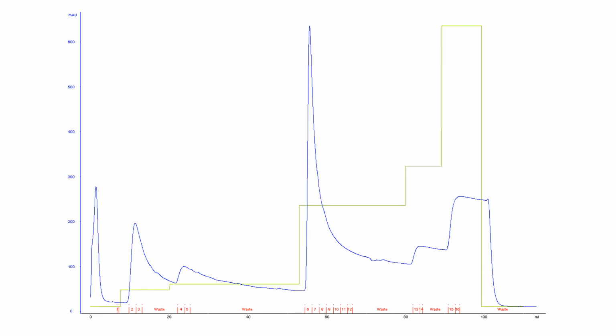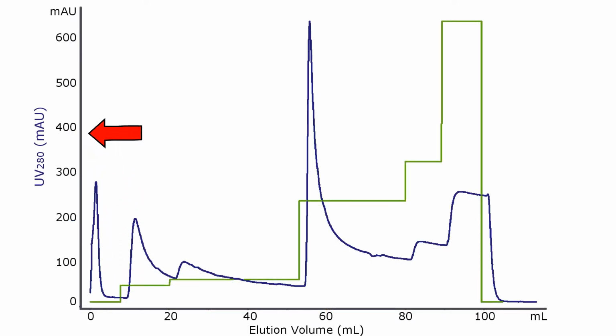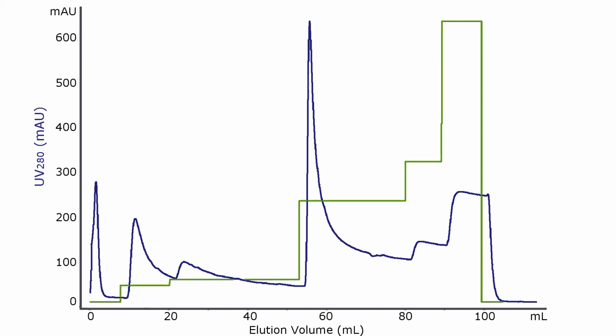Here's a chromatogram I have taken the liberty of cleaning up. As you can see, the y-axis measures UV absorbance, while the x-axis indicates the volume of fluid passed. The blue line tracking the absorbance paints a picture with many peaks, signifying certain points in the experiment in which high concentrations of protein were eluted. Meanwhile, the green line is set at an arbitrary height to identify what percent mixture was used.